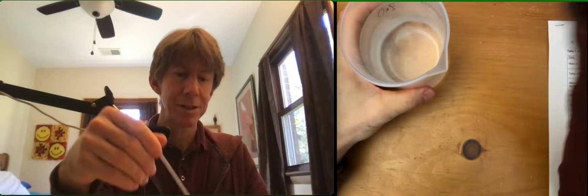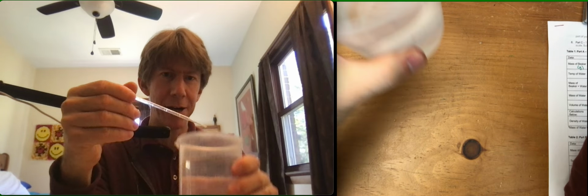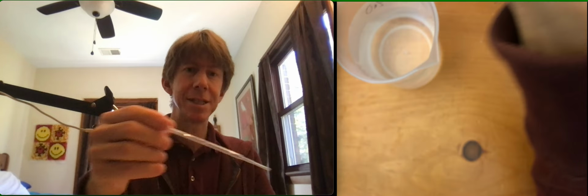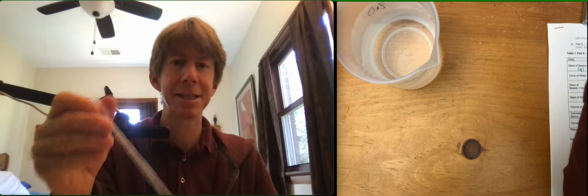So one thing is, you only ever pick up water out of this. If you squeeze any water back, it has to go into your waste. And with 1 milliliter and just water, I'm actually just going to suck it up into the bulb. If you had a solution that you were trying not to waste, you wouldn't want to put all that into the bulb. All right, so I just did that 3 times, and that's conditioning.